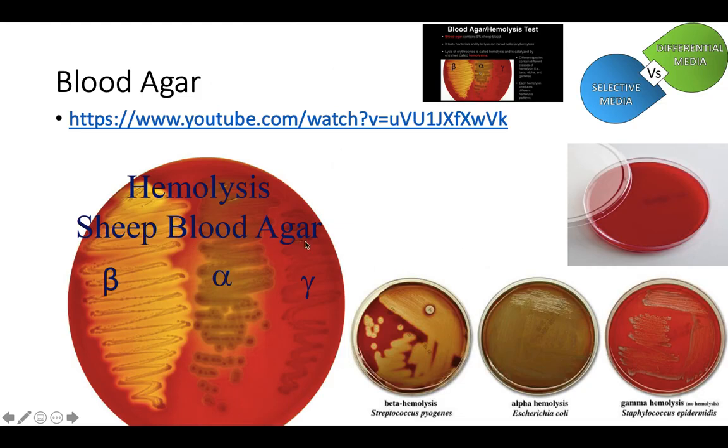Okay, so this agar, blood agar, is essentially nutrient agar with 5% sheep's blood added to it. Sterile sheep's blood from a sheep. Sometimes goats are used. They use sheep because of the proteins that are found on the red blood cells. That's the easiest for bacteria to break down for some reason. Other species have different forms of proteins, which bacteria have a harder time breaking down.